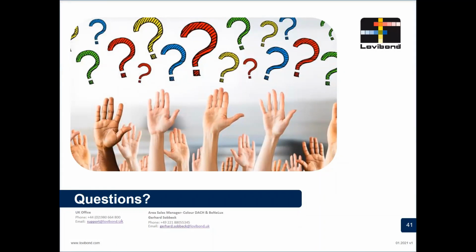Okay, thank you. Do you have to use the verification standard every time you use the machine? How often do you need to verify?